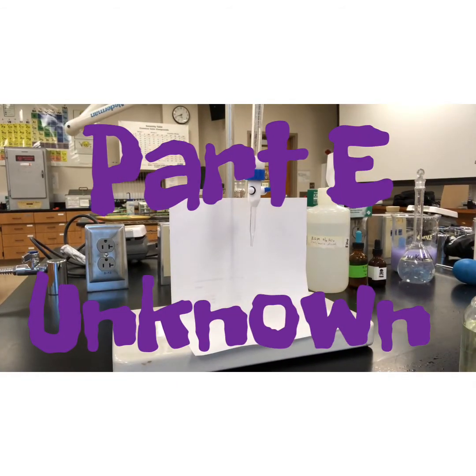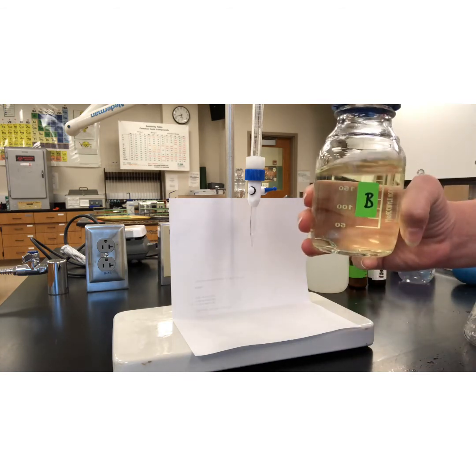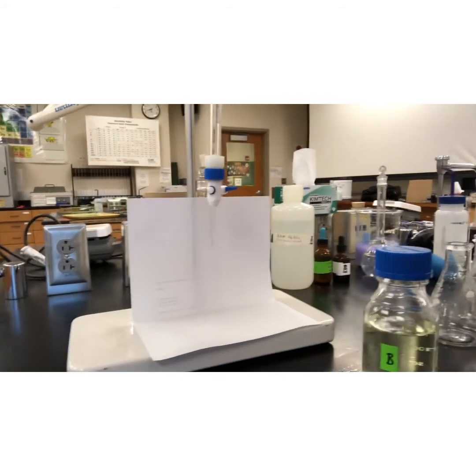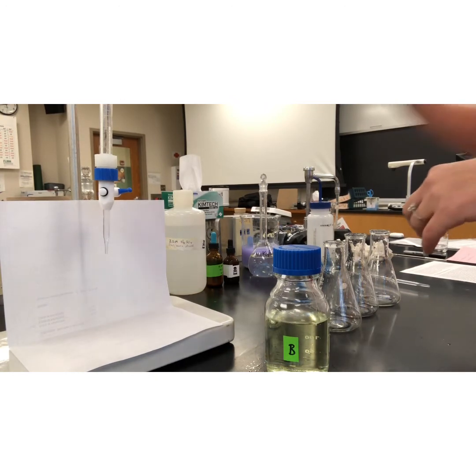All right, part E, finding the concentration of the unknown ferrocyanide solution. So we have an unknown ferrocyanide solution that we are going to find the concentration of. We still know the concentration of our titrant, our zinc sulfate. That is the same solution we made before, so that is the same solution we're going to use to figure out the concentration of this sample. So we're using unknown B as our sample. I'm going to go through my pipetting procedure, do the exact same things we did for the previous section, only with an unknown.